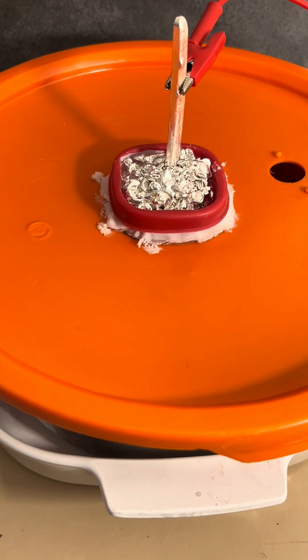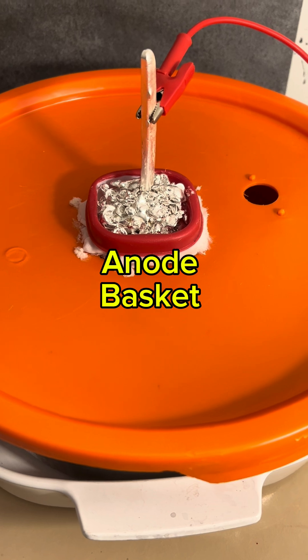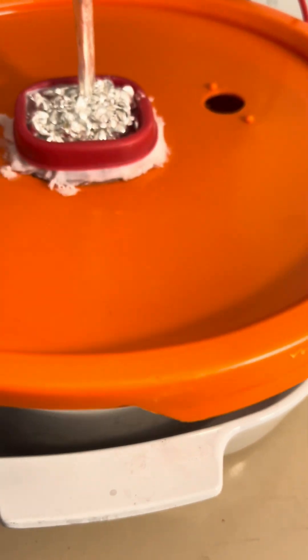This is a silver cell. It uses electricity to deposit silver on the cathode. Let's go over this.